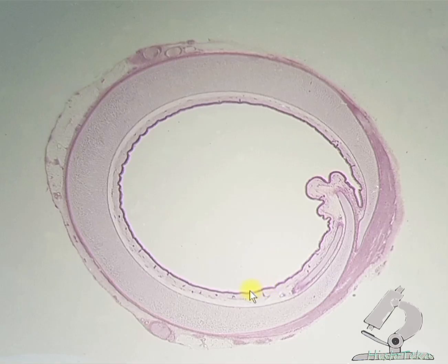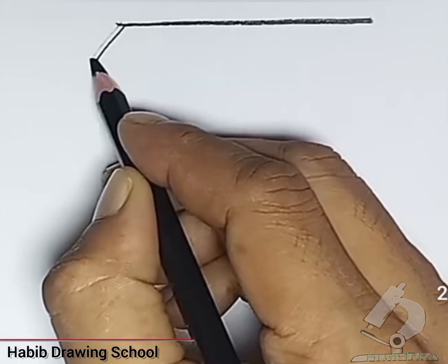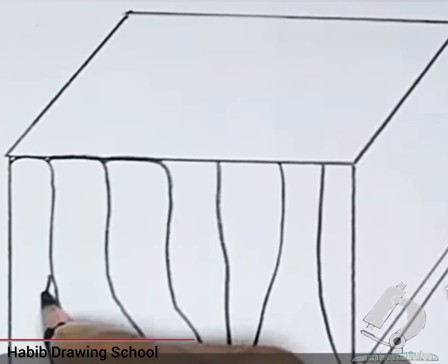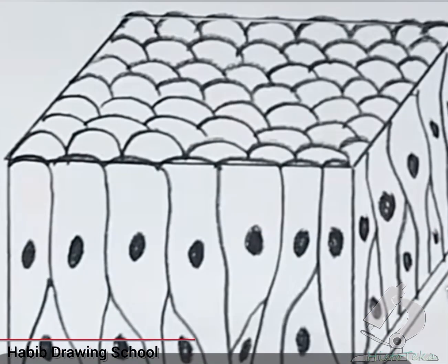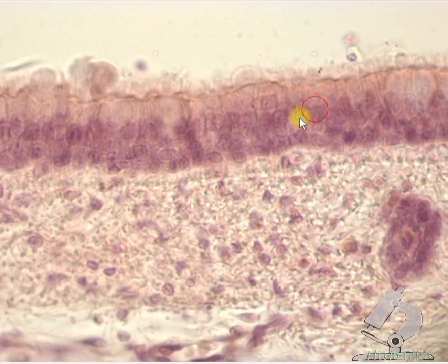Consequently, the inner surface of the trachea is lined with a pseudostratified columnar ciliated epithelium. Pseudo, or false, stratified means that this type of epithelium is simple but looks like stratified, because the nuclei of epithelial cells lie in several rows, meaning they are at different levels. It is primarily due to variation in shape of the cells, which have different heights. That means that their nuclei are also located at different heights.